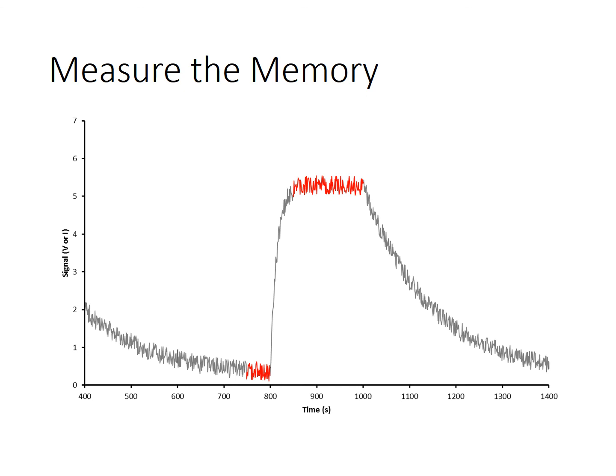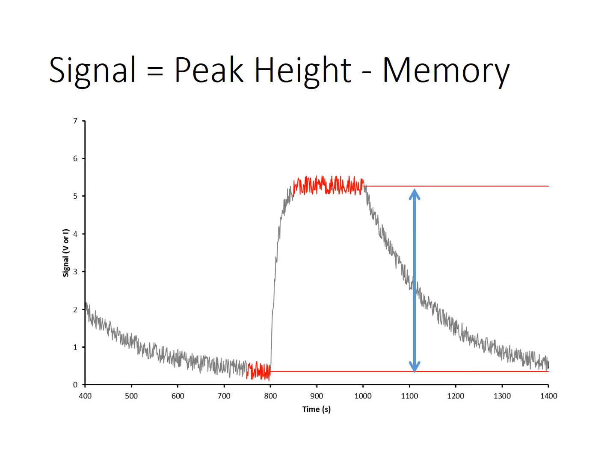Okay, so another good thing to do is to make a measurement of the memory before you measure your sample. So rather than measuring that to the baseline, you measure that to that. That allows you to, so you basically have to measure the memory as well.